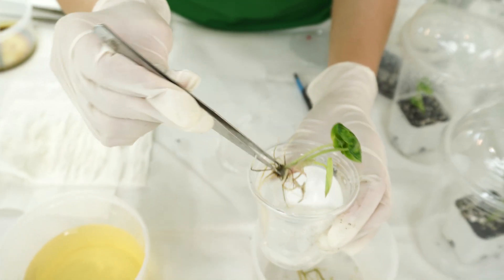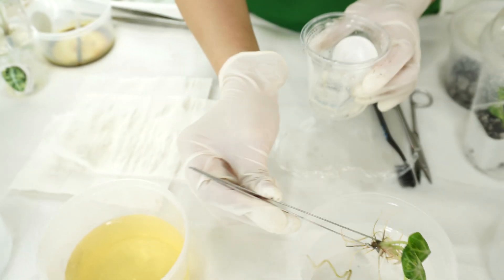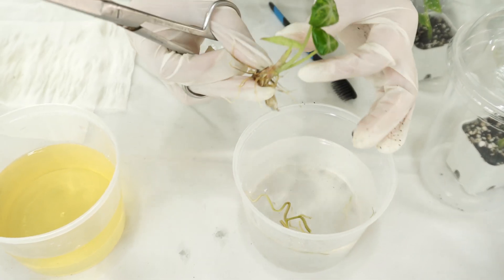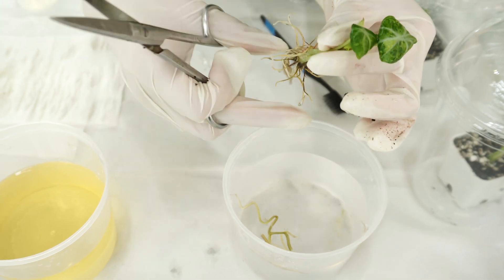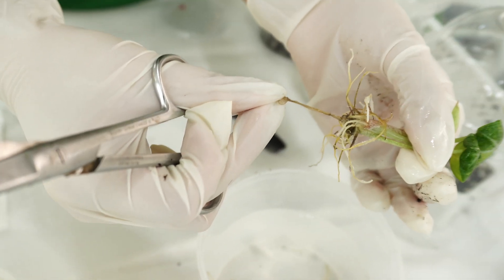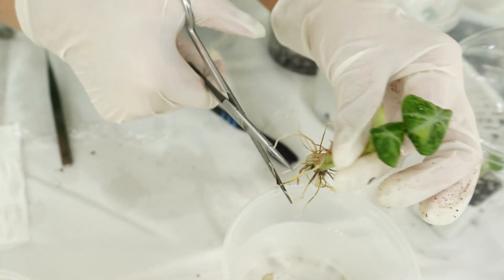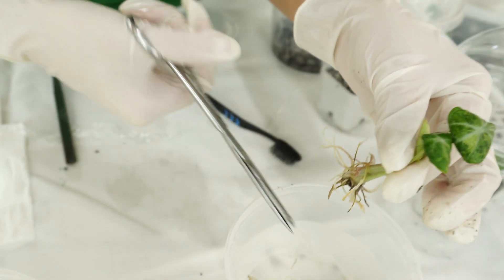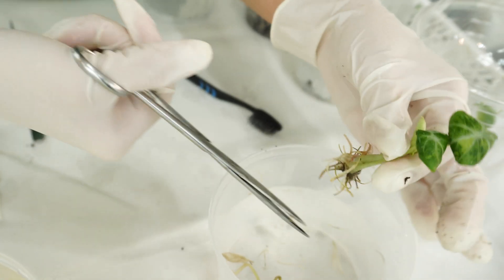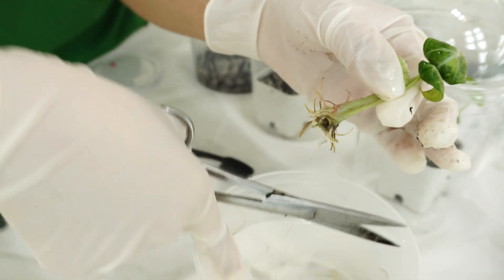You just have to repeat the same steps that you've seen from the beginning of the video. Trim a little bit of the root, and trim any dead or yellow leaves that you can see. Then clean the plant and the roots thoroughly, making sure there is no gel or agar stuck to the plant or its roots.